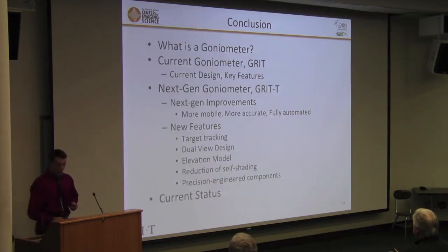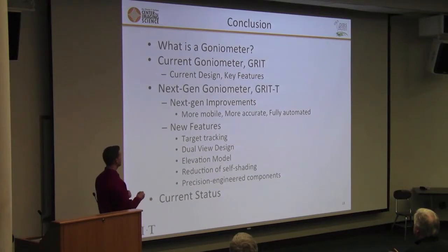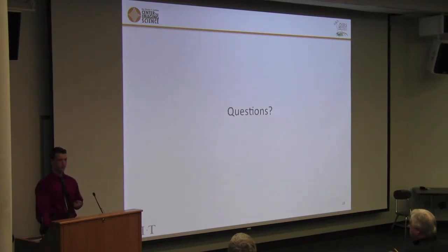So, in conclusion, this is what I told you about today. Key features of the new goniometer that we're building: more mobile, more accurate, fully automated, target tracking, dual view design, elevation model, reduction of self-shading. So do you have any questions for me?